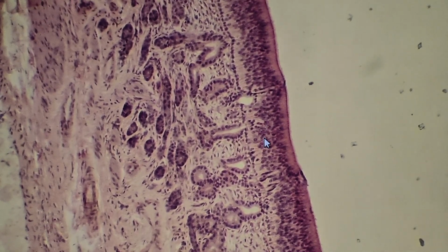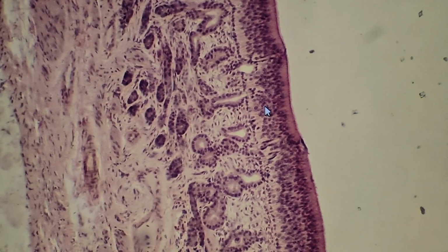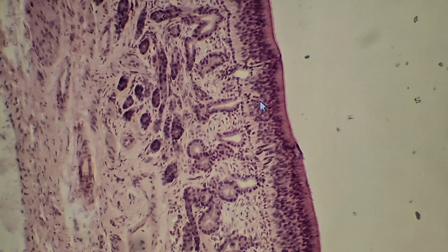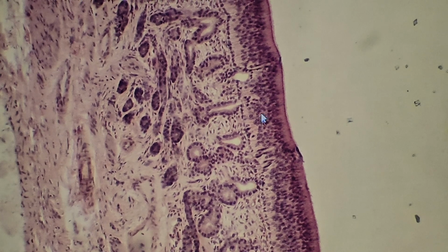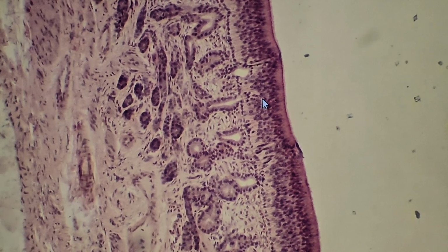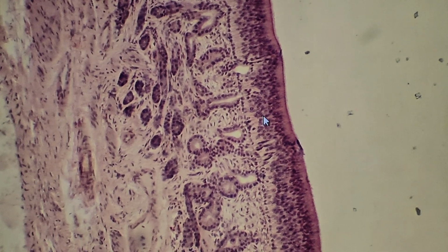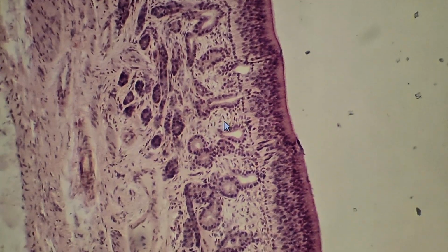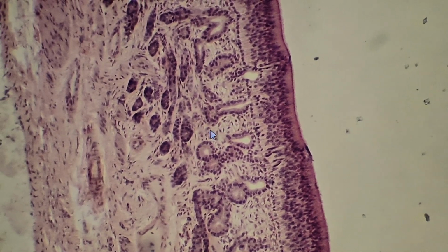The apical region or the apical pole of bipolar neurons has long non-motile cilia acting as chemoreceptors. The basal ends of these neurons have axons extending through the epithelium into the lamina propria and uniting to form a small nerve.